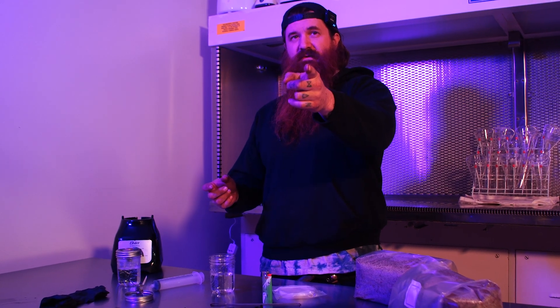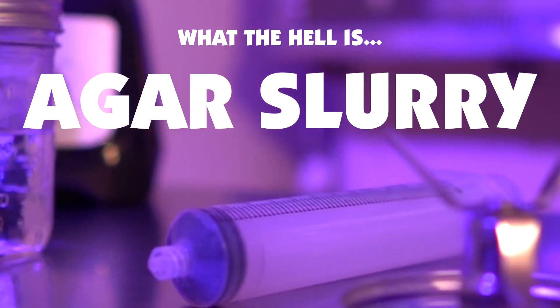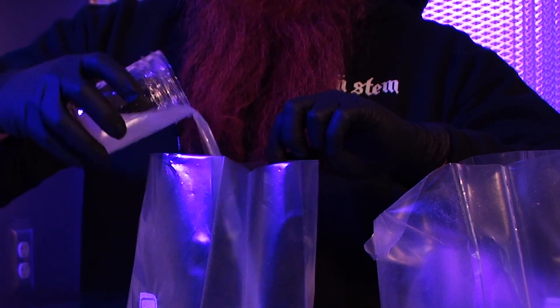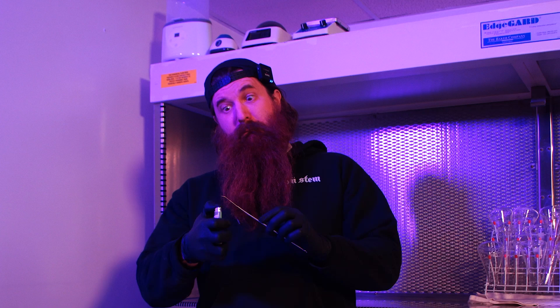Okay, so what we're going to do today is walk through the production of an agar slurry. This is a very quick and interesting way to not have to generate a gran spot.